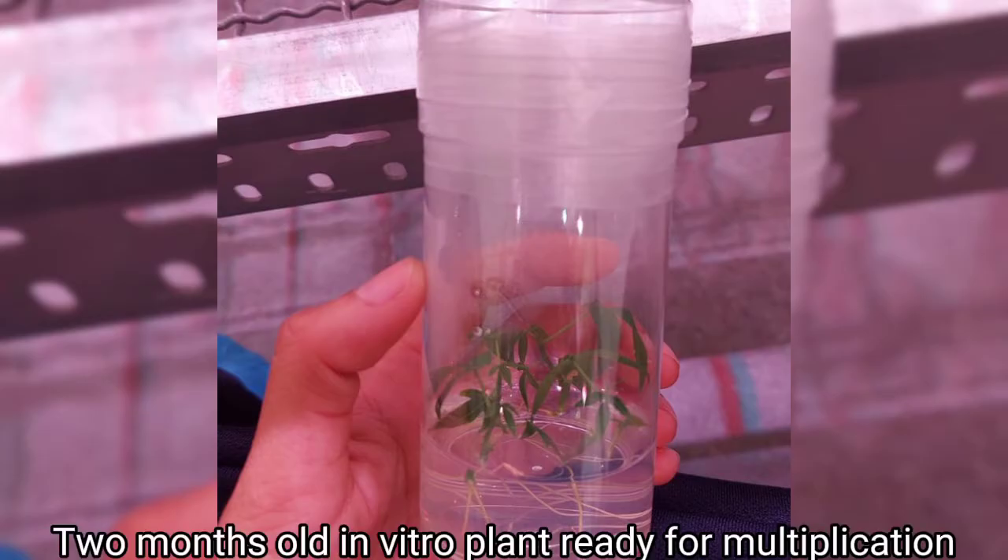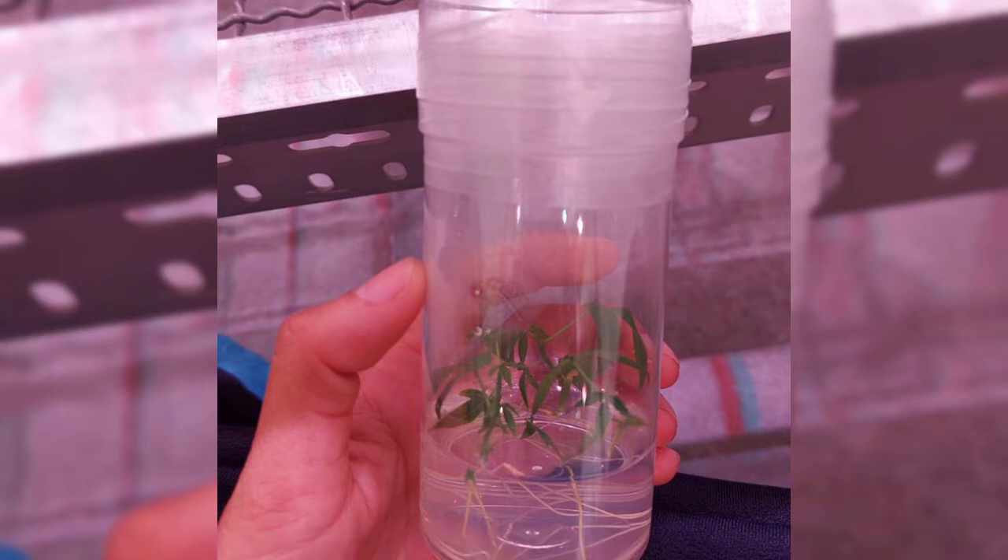Here is a 2-month-old cassava in vitro plantlet and it is ready for multiplication. We'll be using it as our planting material.